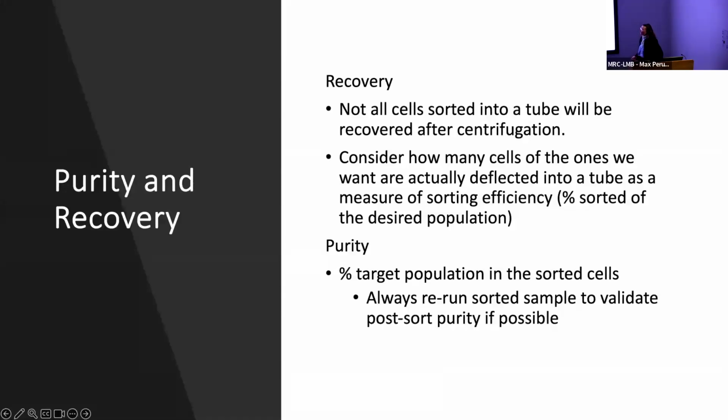I also recommend that we will provide you with a number on the side of the tube that will indicate approximately how many cells are in there. But it's always good practice, after spinning down, to actually double check on your own counter, whether it's using a cytometer or some kind of cell counter, just to double check that indeed it should match very closely to the number that we provide to you.